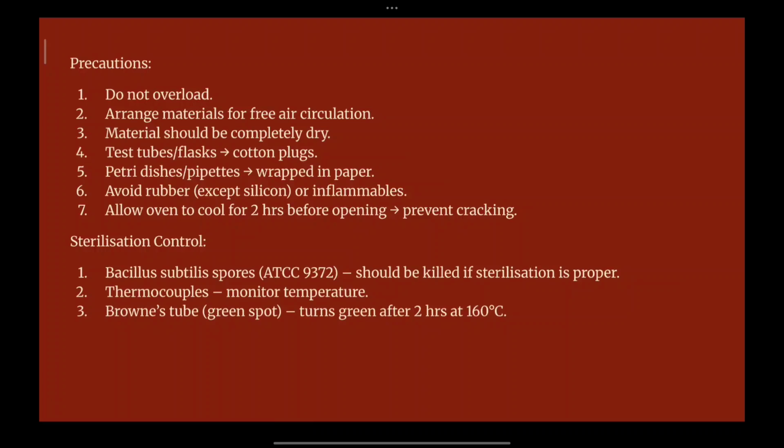These are bacterial spores that are present on a tape, wherein you can stick the tapes on the equipments that you are sterilizing. Once these Bacillus subtilis spores are exposed to the dry heat sterilization, they are going to show the indication as black color strips. So this can prove that the equipments inside are sterilized.